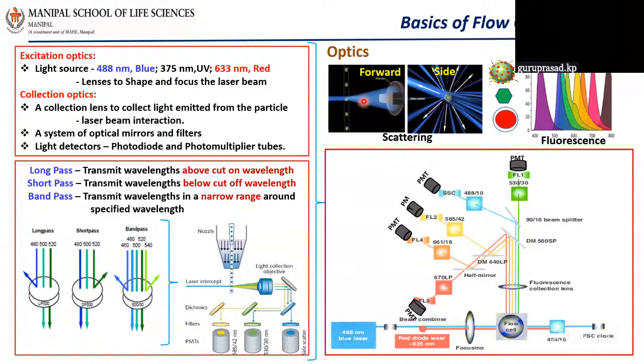The first thing is the small angle scattering. Just imagine, take a ball, put a torchlight on one side and observe the light from the other side. It looks like a complete eclipse. Light is coming from all the sides of the ball. This kind of thing happens here also.